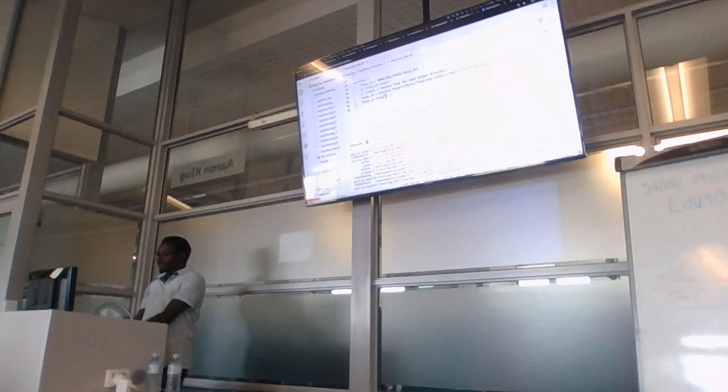So what we do here is now call it here as a fastp run, and it's going to take this channel, the reads channel, as its input. Okay. And we can call this as stream reads channel.